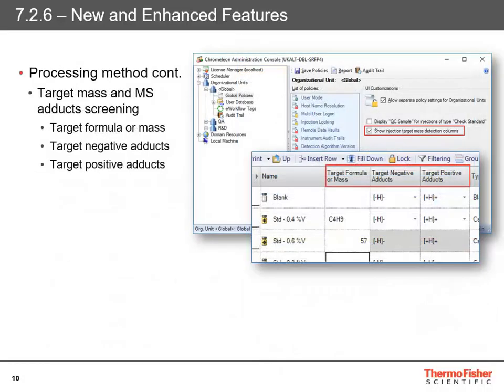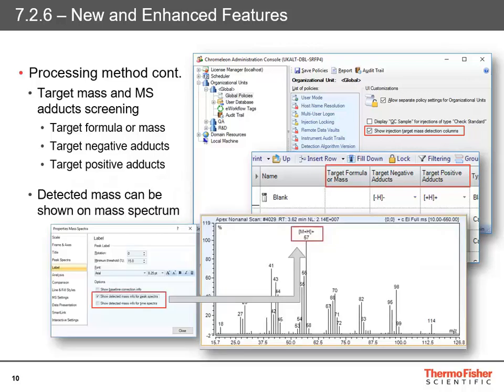Another addition to the processing method is the ability to look for target masses and adducts during screening. If you're working with a high-resolution accurate mass spectrometer, you can add a target formula or target mass and also look for positive or negative adducts within your traces and identify those. When you have a hit, the detected mass can now be shown on the spectrum above the peak.